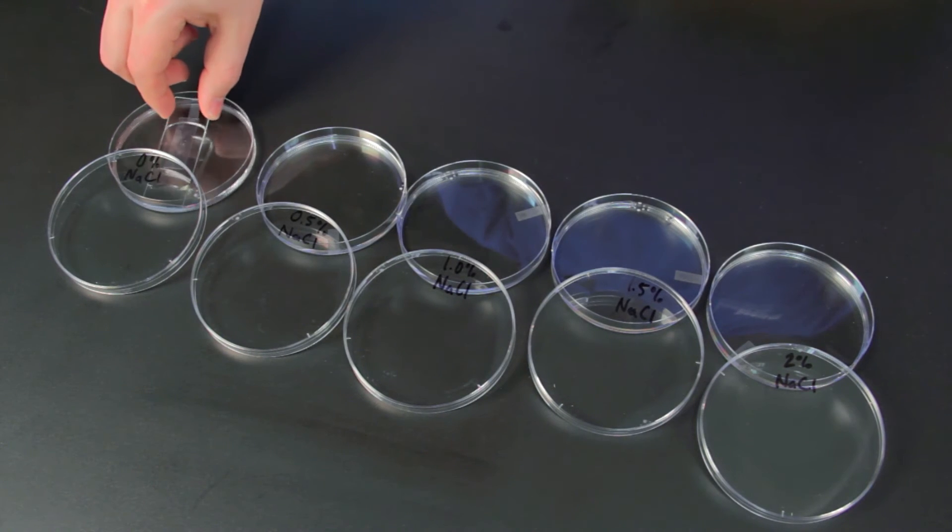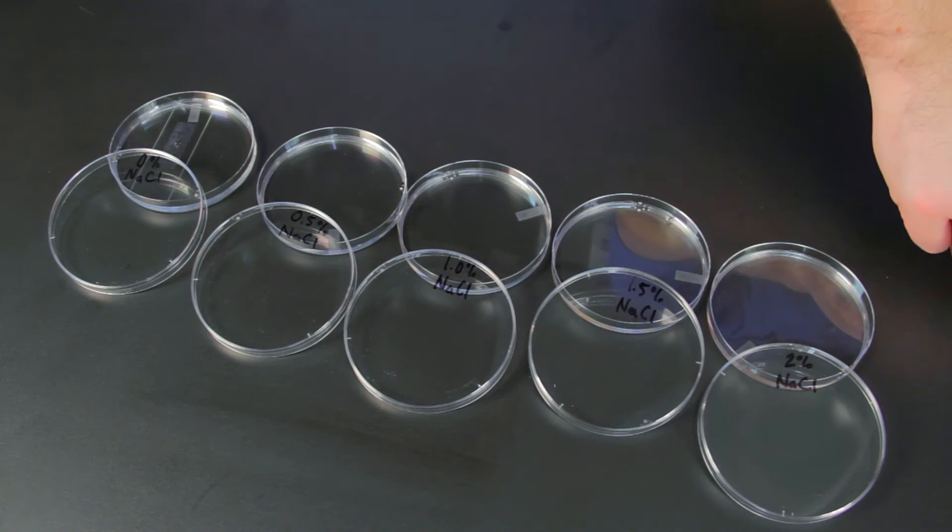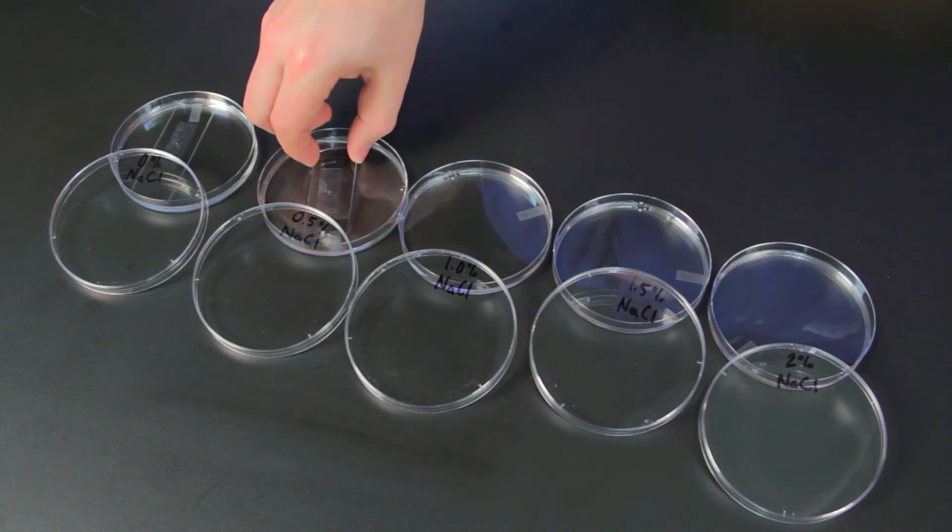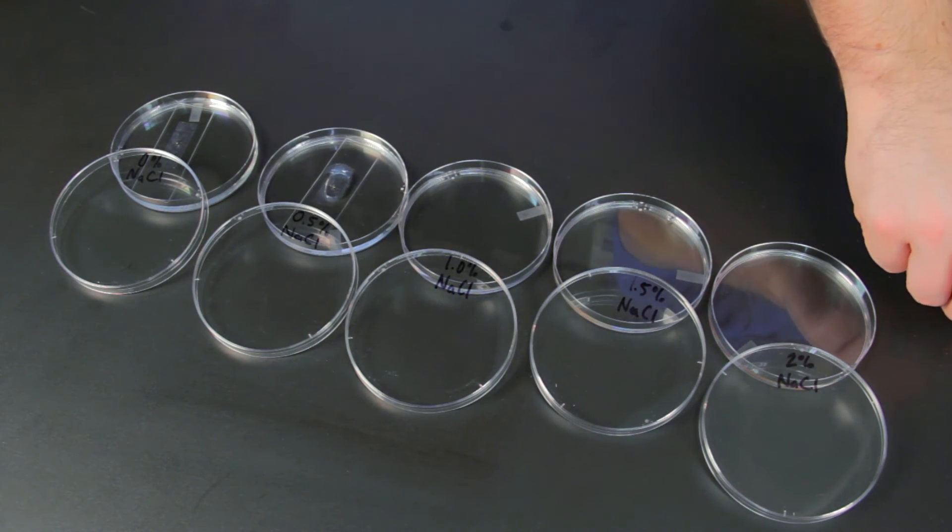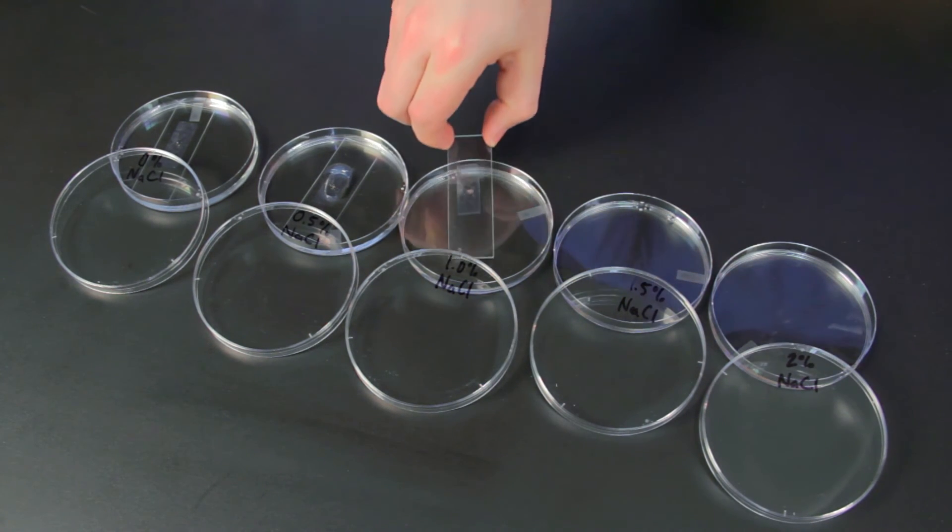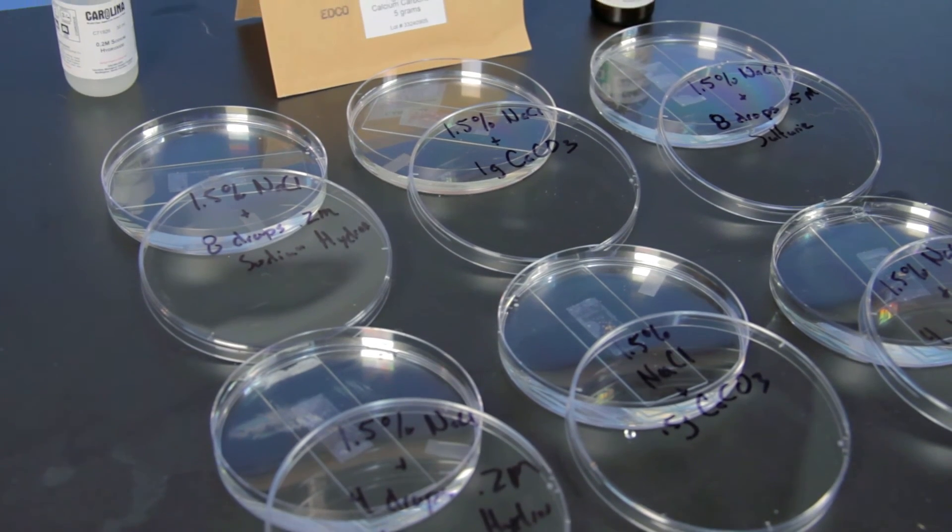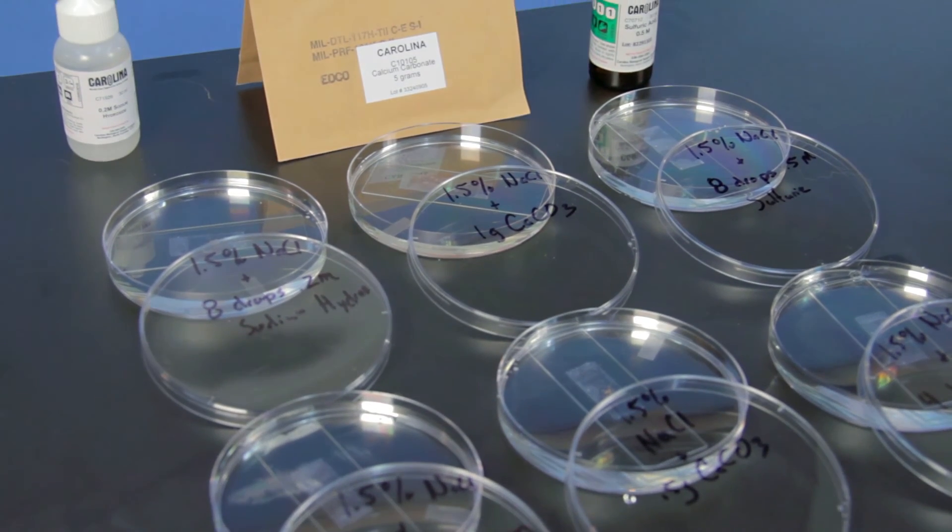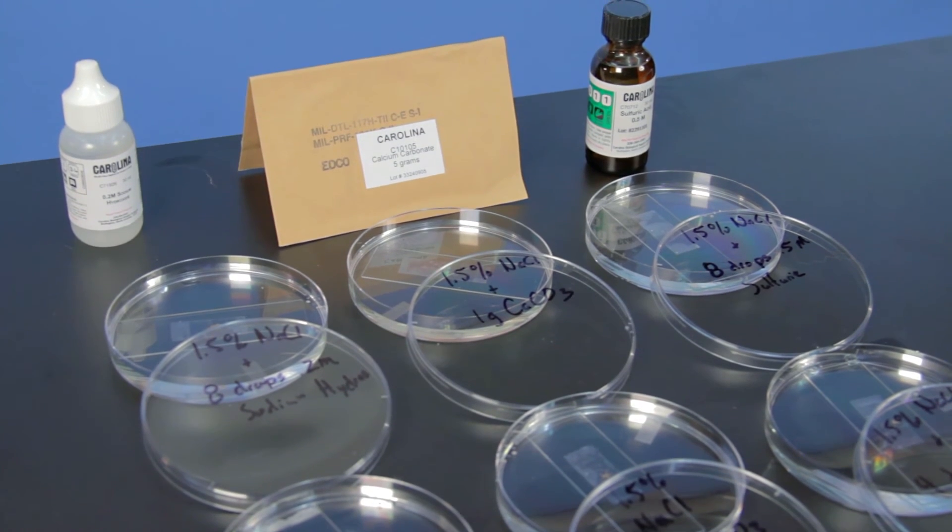The lab is recommended to be started early in the week as each activity needs to run for at least three consecutive class days to measure results. The kit comes ready to use, so teacher preparation time is minimal and all activities are designed to easily fit in a typical 50-minute class period.